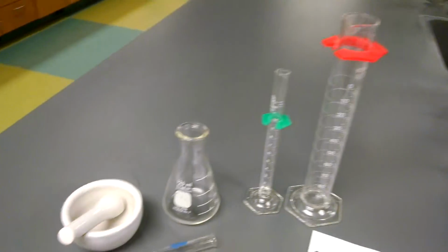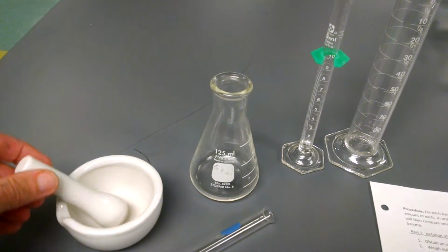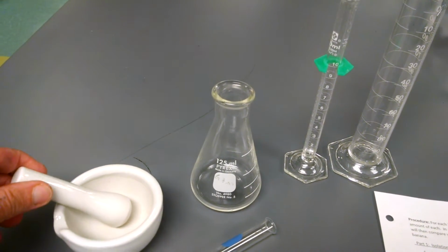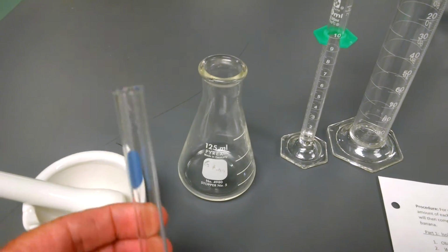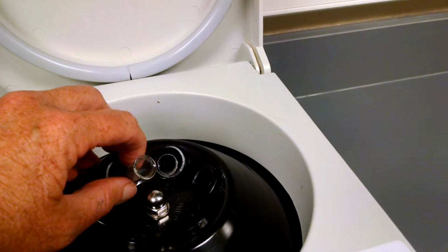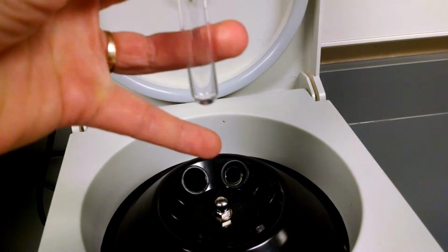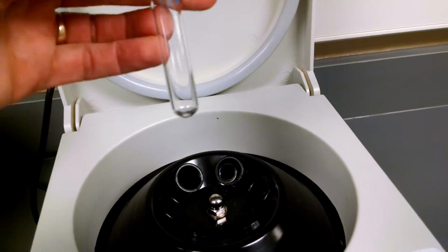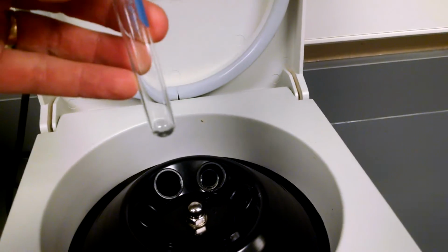So what you'll do is you'll start out with a mortar and pestle. You'll have a sample of banana. You'll be grinding it in here with some water. You will then transfer that into a small test tube, which you will put in something called a centrifuge. And the centrifuge will spin this around so that you'll end up with basically a pellet of banana starch on the bottom and then some liquid, which we call a supernatant, on the top.